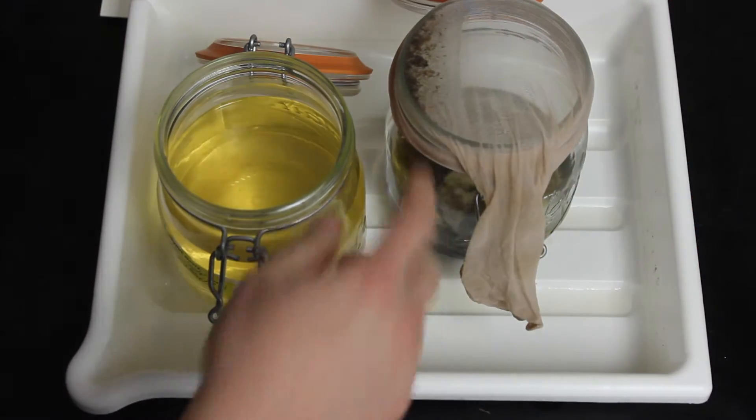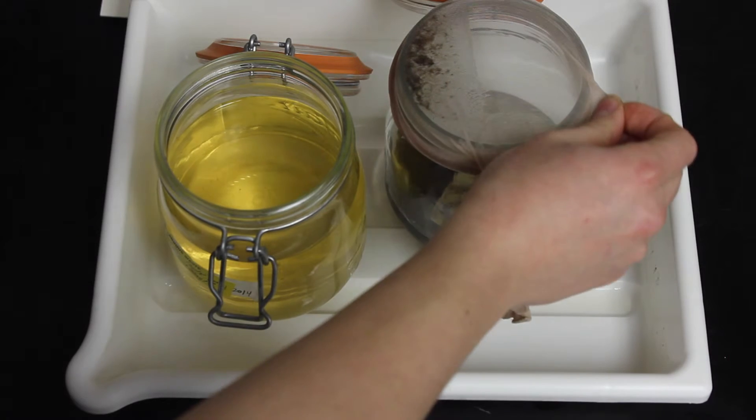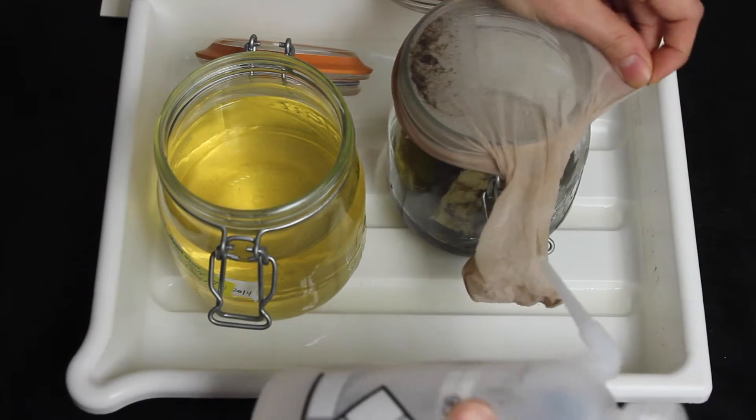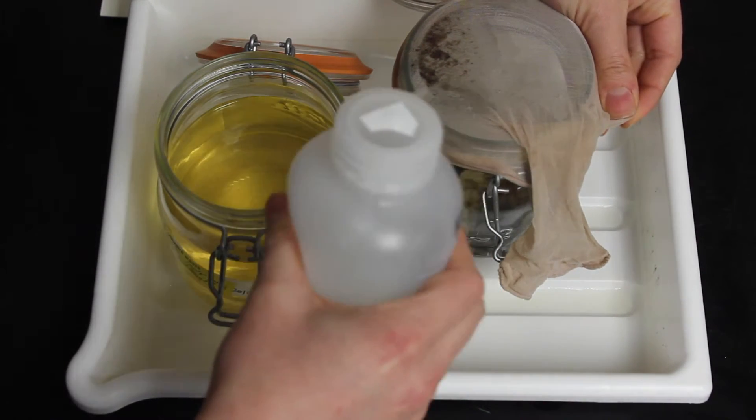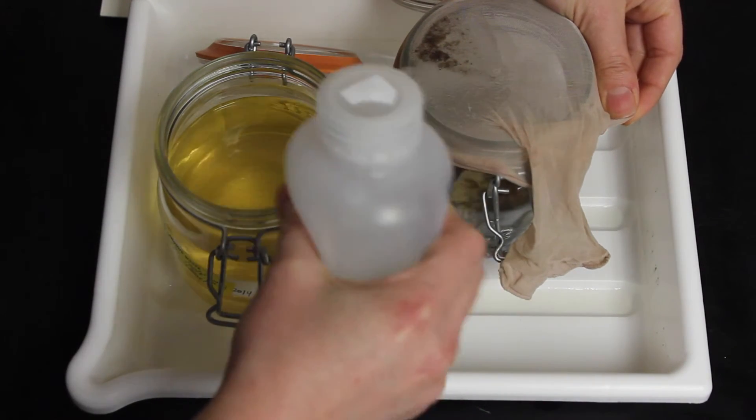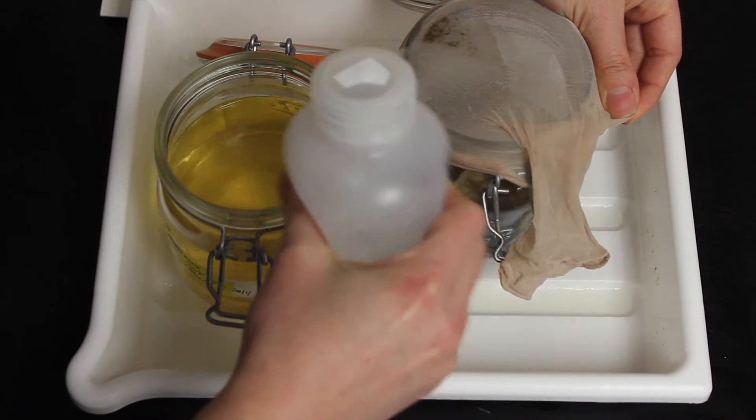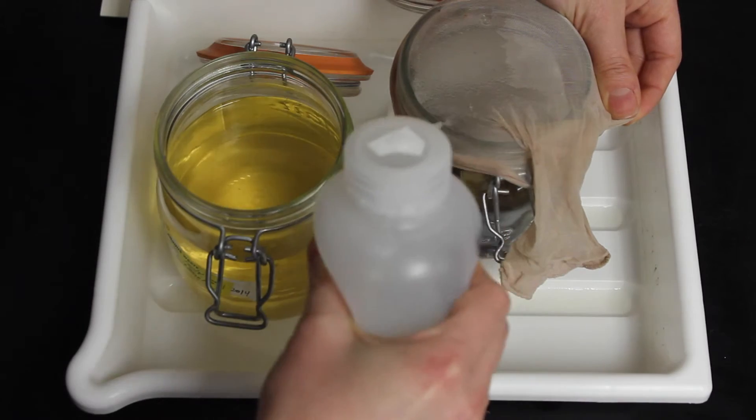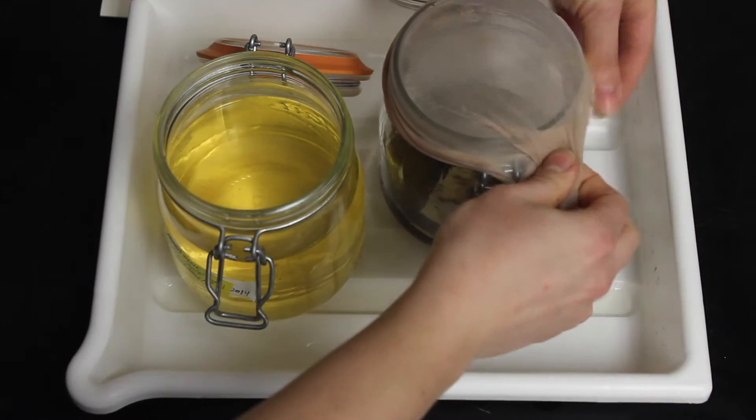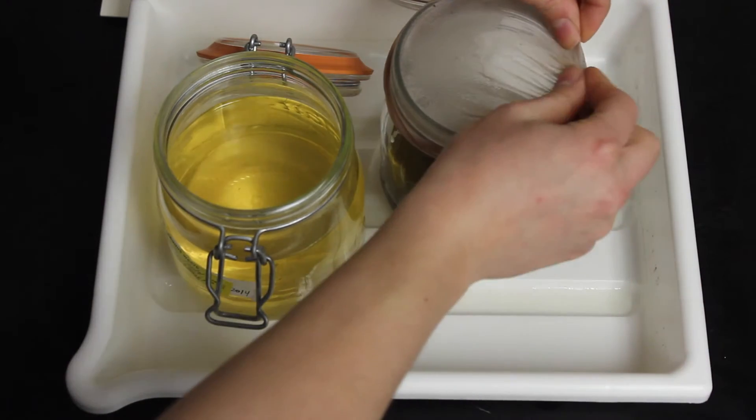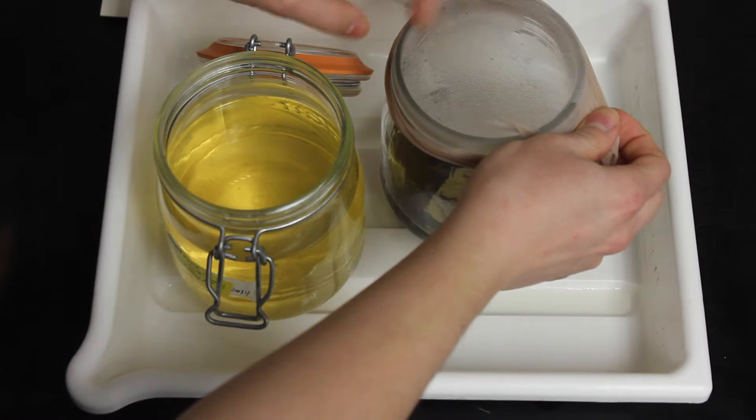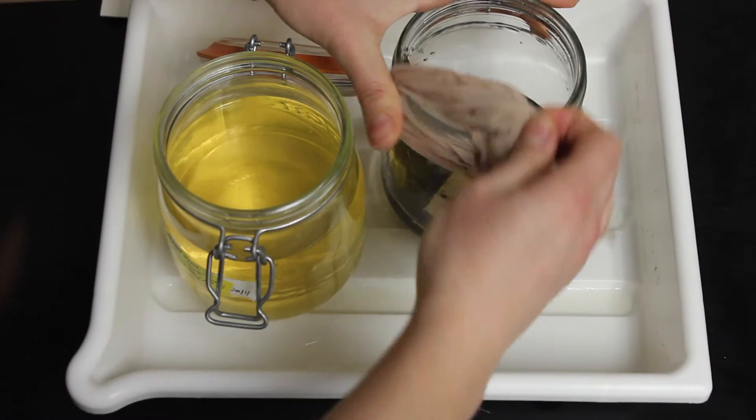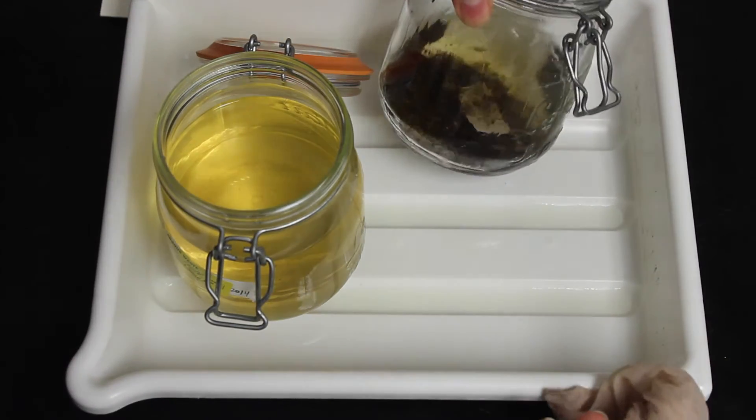But we're not done. Some of our organisms have stuck to the pantyhose. We're going to take our 95% ethanol and wash them off. Once you've made sure that there's nothing left on the pantyhose, you can take it off. And there you have it.